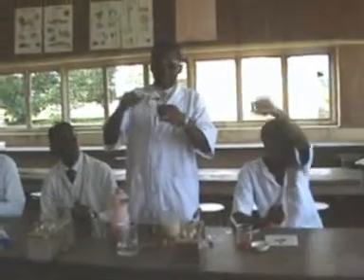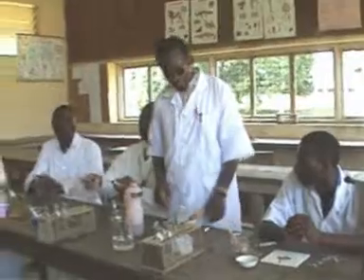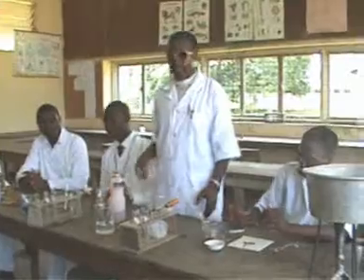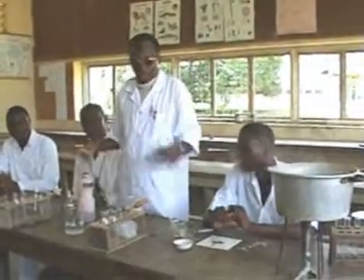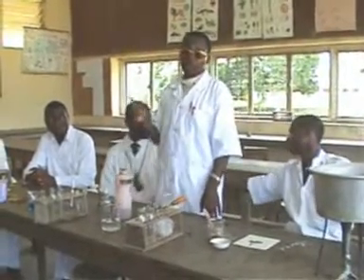So the next item now is we have carried out these experiments and we have observed throughout and we have had now our results. Then how do we report it? In reporting, which is the most important part, because the examiners will only mark what the students have written. They will not mark what they did. So if a candidate does something like we are doing right here and you don't write it down, then it means that you will not have any mark because you cannot mark from space. So I will go to the board and you'll see how this reporting can be done.